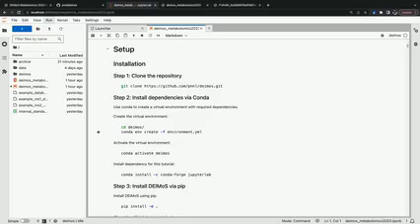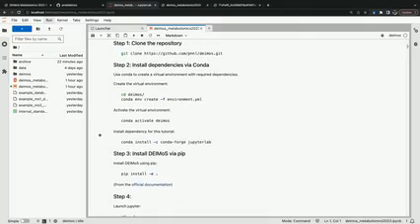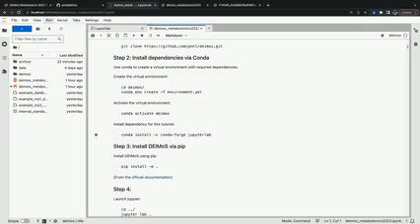But essentially, you can download DEIMoS via Git, and the instructions are included there. And for those of you who aren't familiar with the Python or Anaconda ecosystems, the easiest way to install DEIMoS is via Conda. And to do so, we've included an environment YML file, which includes all of the dependencies for DEIMoS. And so you can simply install all of those dependencies via Conda, and that'll produce the needed environment. Once you have the environment downloaded, you can conda activate that environment.